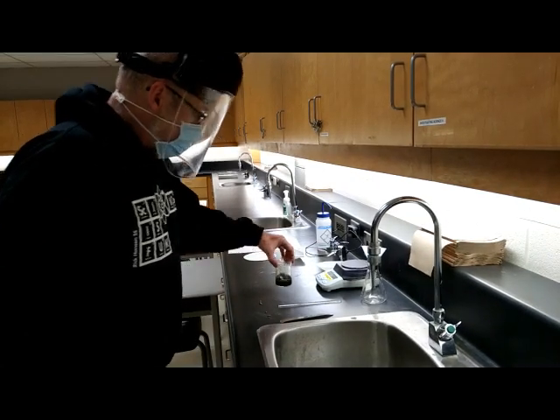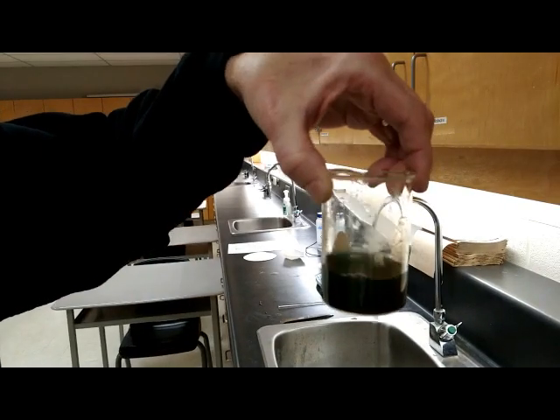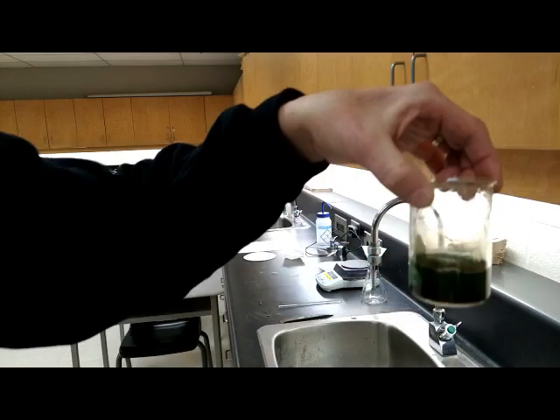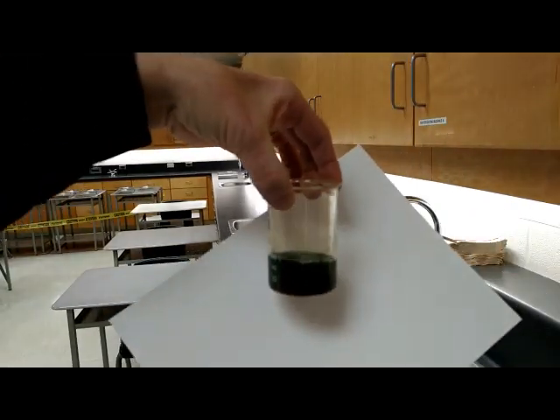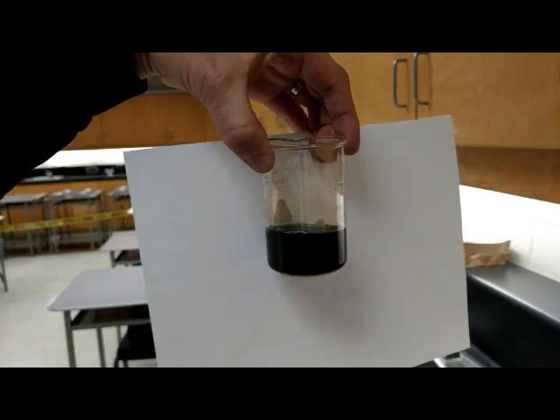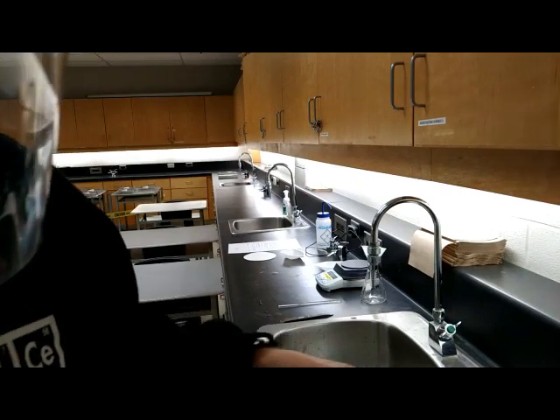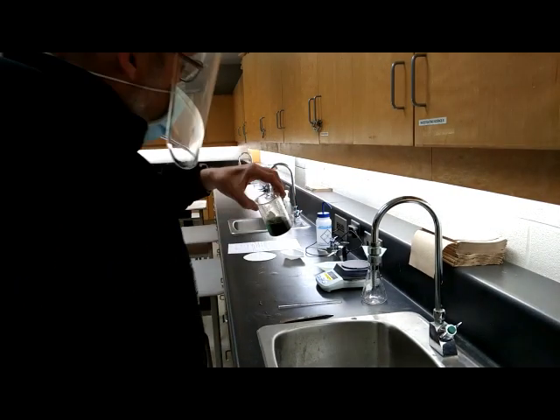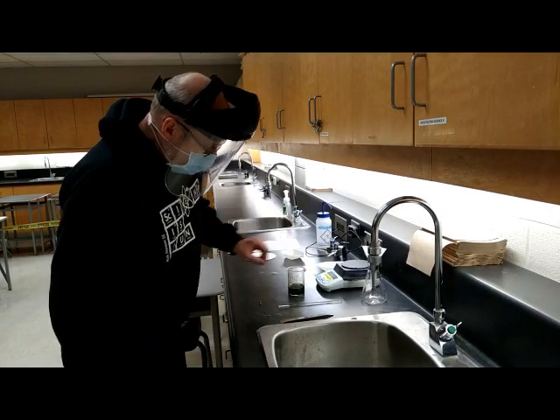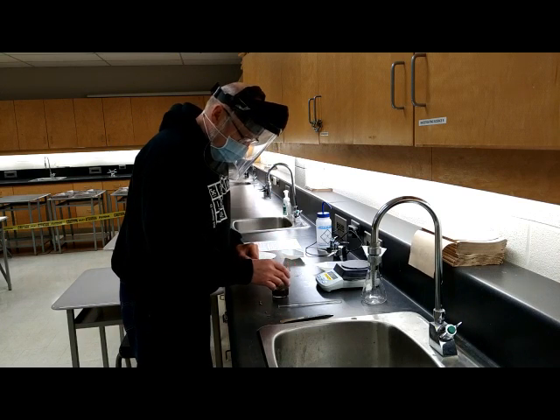You'll notice that we still have a greenish tinge to the beaker, but with paper behind that, you can see the color, a little bit on the green side. And that's good because we still have some of the copper 2+ ions in there, and that's just fine. Okay. Roll that around a few more times.